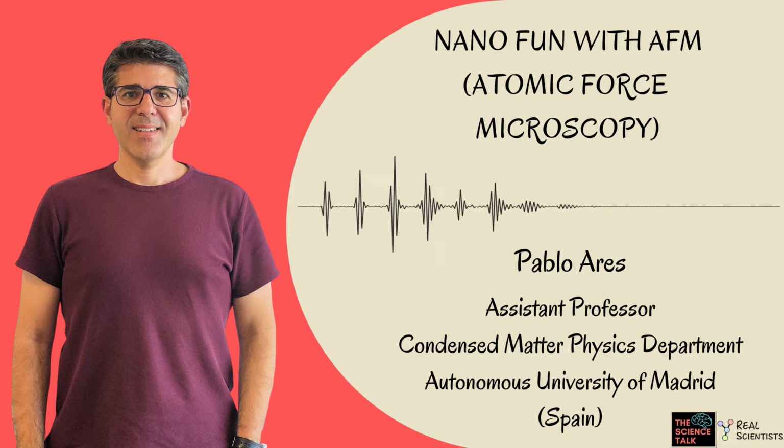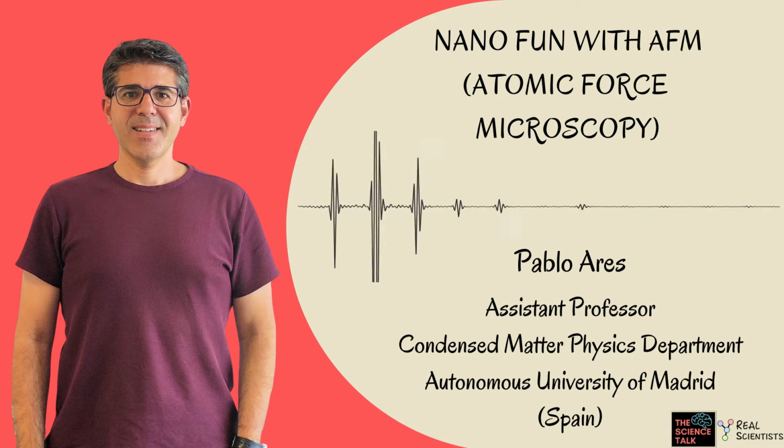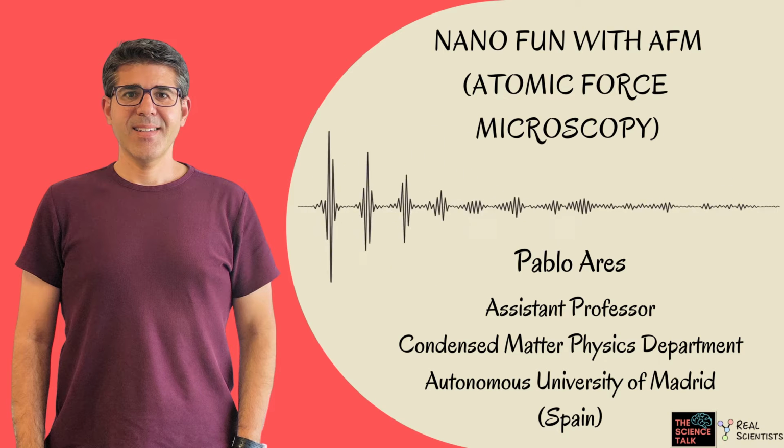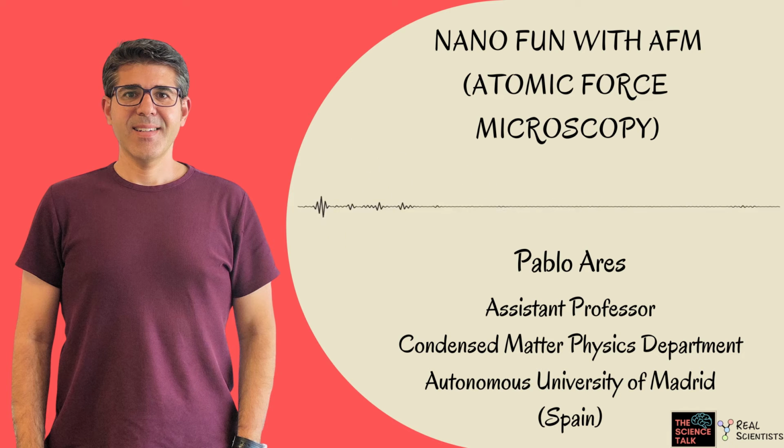For example, one of my favorites is gold nanowires, because we've been using the AFM tip to manipulate gold nanowires, to move them and assemble them to make nanoelectrodes. That was quite fun to play around with, and to see that we could cold weld them and make nanoelectrodes in a controlled way.